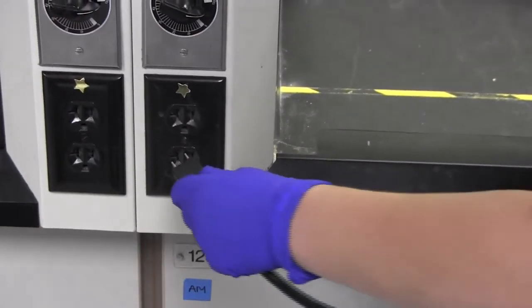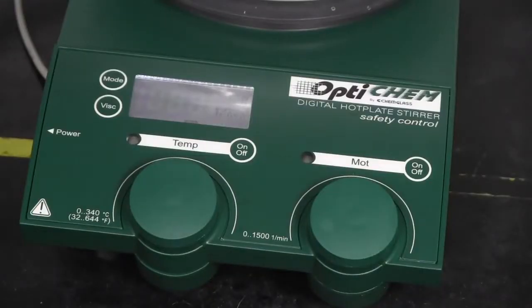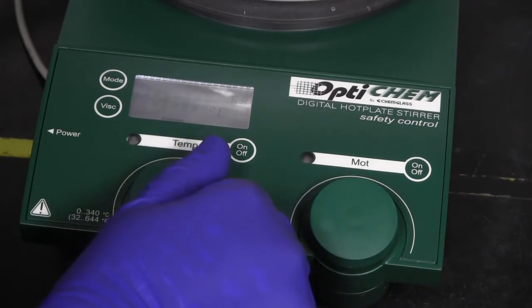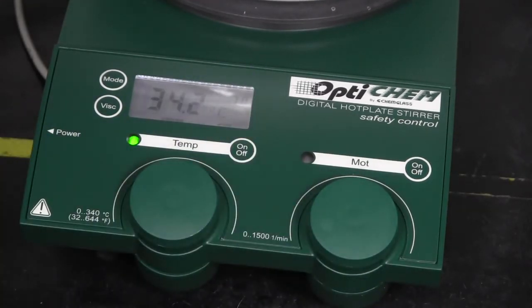Plug in your hot plate into the bottom outlet. The top one uses a different setting. Then turn on the heat by adjusting the left knob. Set the desired temperature by looking at the smaller number in the upper portion of the LED screen. The larger number is the current temperature.